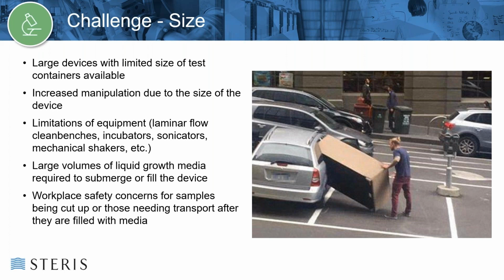Those all would need to be fit into the incubator, and we need between 10 or 100 depending on the validation type. Additionally, sonicators and mechanical shakers have limitations to the size of items that can be placed in them or on top of them, as well as the weights associated with that.